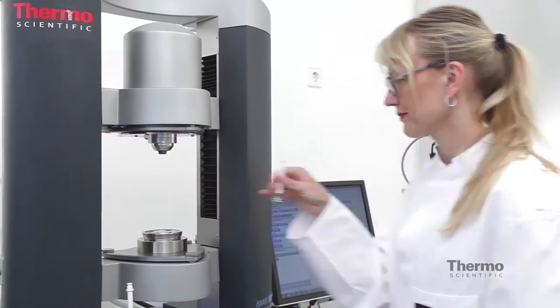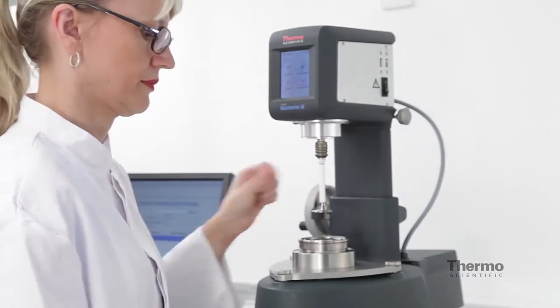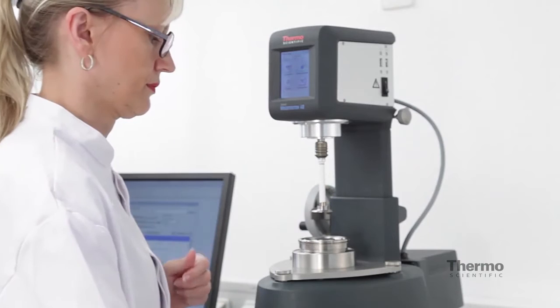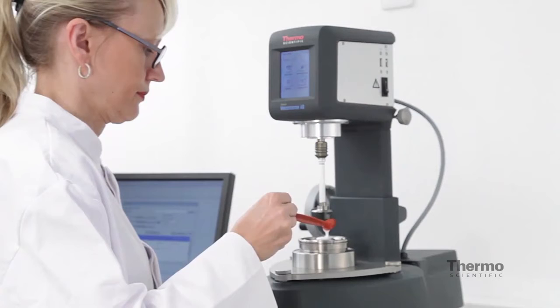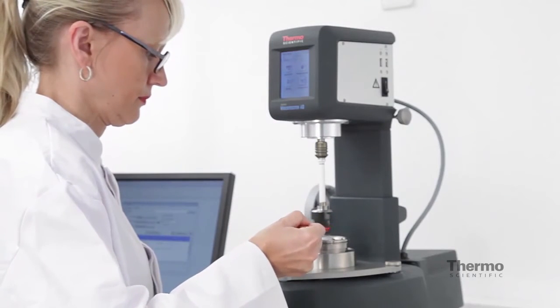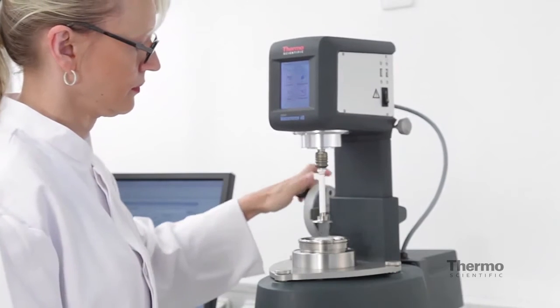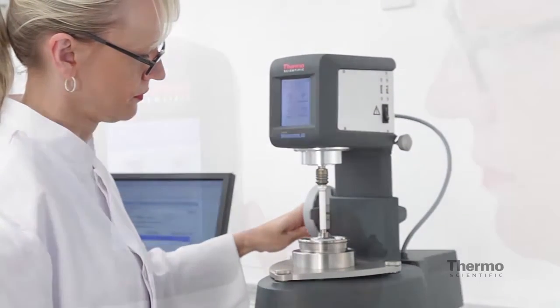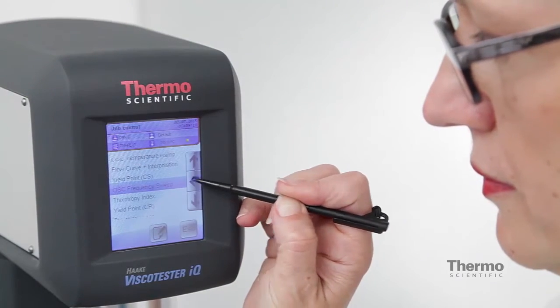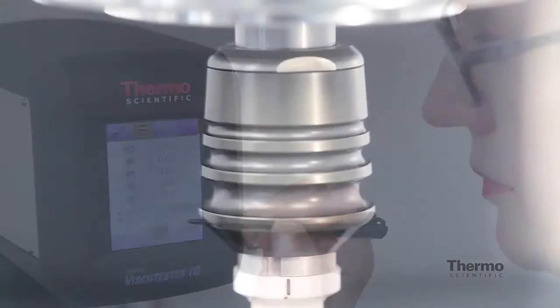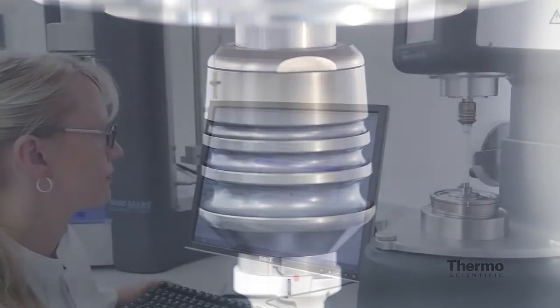The new quick fit ceramic shaft rotors with rotor recognition can then be directly transferred to our also new QC rheometer Thermoscientific Haake Viscotester IQ together with the respective routines that need to be run in QC afterwards. Here you can conduct those routines designed on the MARS platform either in standalone mode or software control and that also in oscillation.